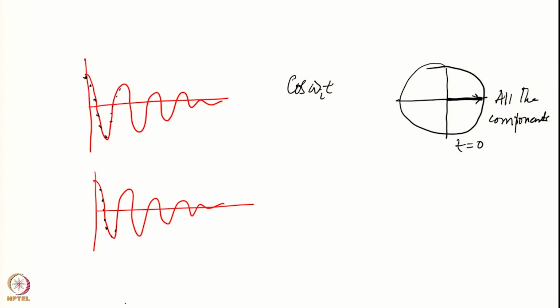This can be a small time, a few hundred nanoseconds, that has nothing to do with the dwell time, it has some hardware limitations. So you may want to give a small delay here, we may call it T naught. So your actual data collection starts from T naught. Therefore your signal here will be cosine omega (t plus T naught).